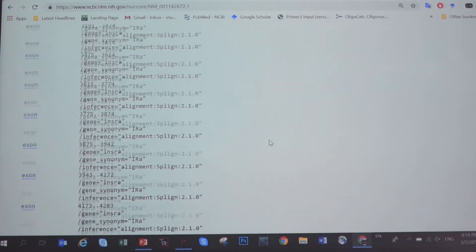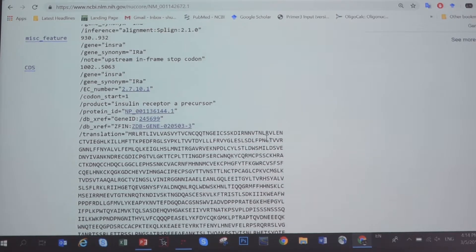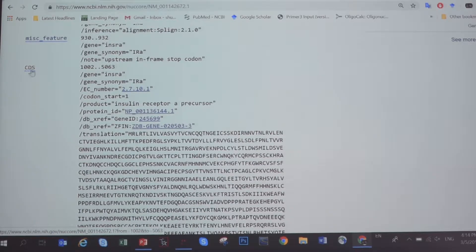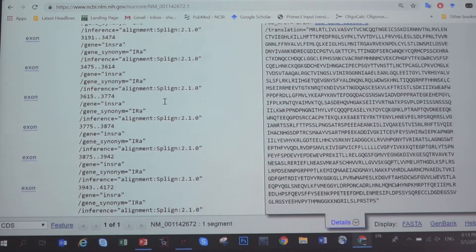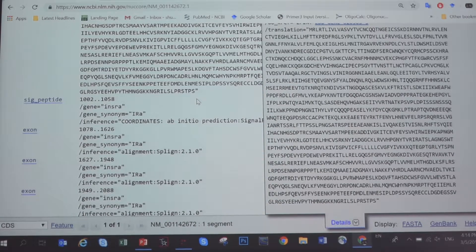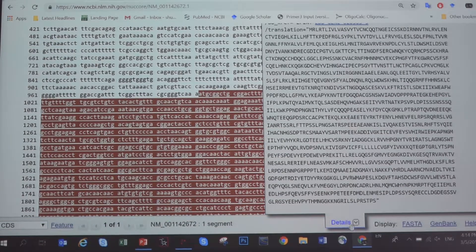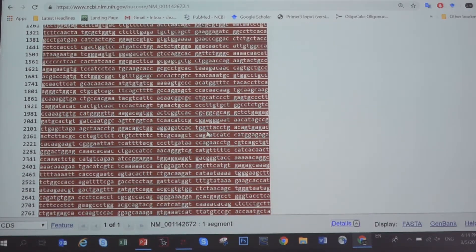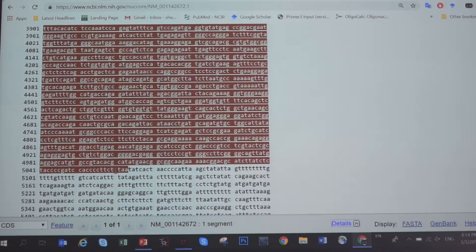Once you've done that, go back to the sequence website. In GenBank you can find the coding region. Click on the CDS coding widget.